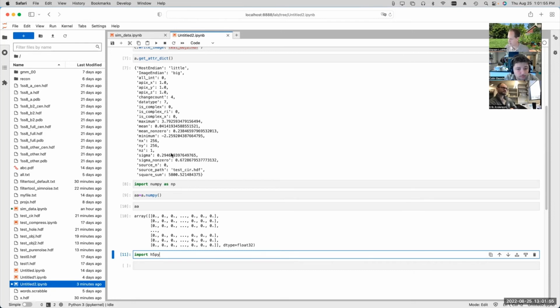Certainly a lot of the output files that come from running the neural network are all going to be image files, but the network itself in the early days, Muyuan did not save. He only saved associated files and then rebuilt the network as necessary. But now it's become easier to save the networks. That HDF5 saving capability was broken apparently for a long time in TensorFlow, so it's only recently become possible to rely on it. So you're absolutely correct. You might find some places where EMAN isn't using that HDF5 mechanism in TensorFlow. Okay.